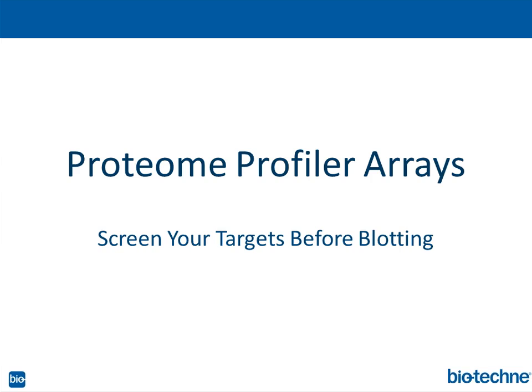So what I think is a nice complement to Western blotting is a technique we call proteome profiler arrays. This is kind of what I would consider a systems biology approach to protein identification and semi-quantitation. By the way, Western blotting and these arrays are semi-quantitative, because really what you're doing is pixel density. There's no absolute quantitation here, as you may know.